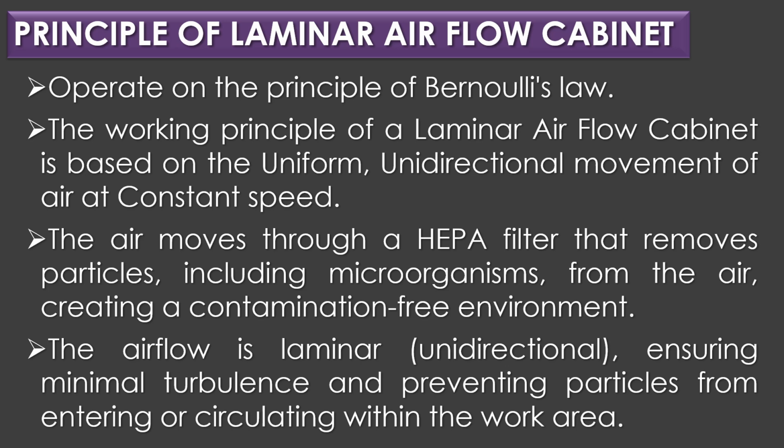Principle of laminar airflow cabinet. Laminar airflow cabinets operate on the principle of Bernoulli's law. The working principle of laminar airflow cabinet is based on the uniform, unidirectional movement of air at constant speed. The air moves through a HEPA filter that removes particles, including microorganisms, from the air, creating a contamination-free environment. The airflow is laminar, that is unidirectional, ensuring minimal turbulence and preventing particles from entering or circulating within the work area.